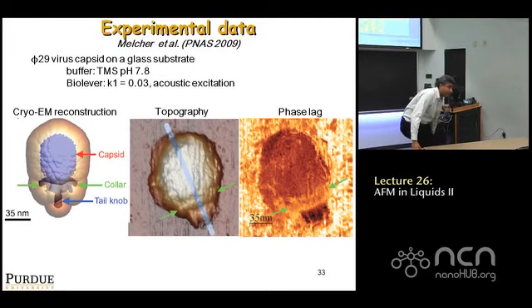Because you say that there is a lot of understanding for liquid base. I mean, air-liquid interface, right? I haven't actually talked about air-liquid interface yet. Yeah, but let's say the air has certain humidity. Is it possible to adapt some humidity control in the AFM so then you can make it quite dry?